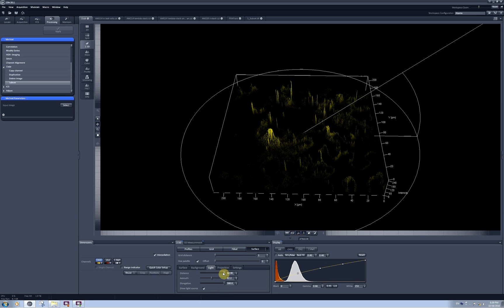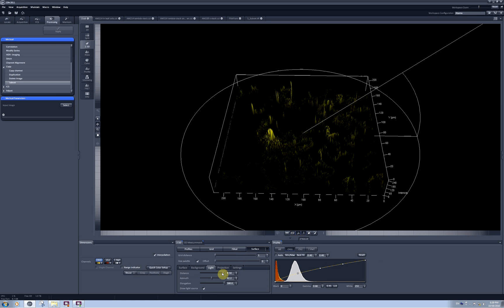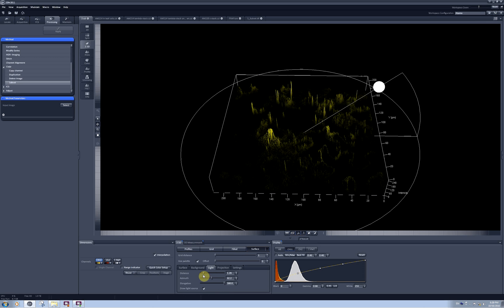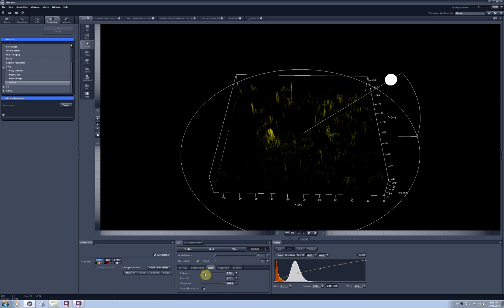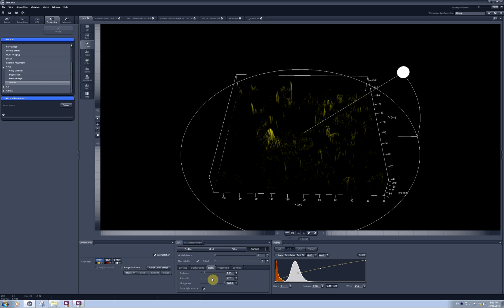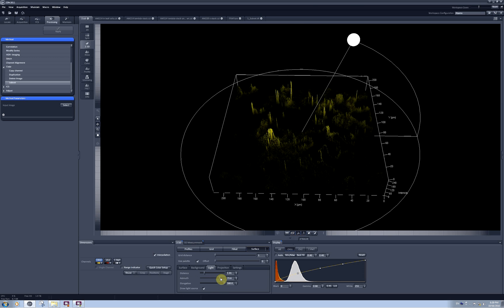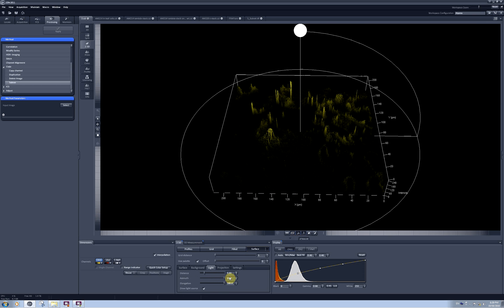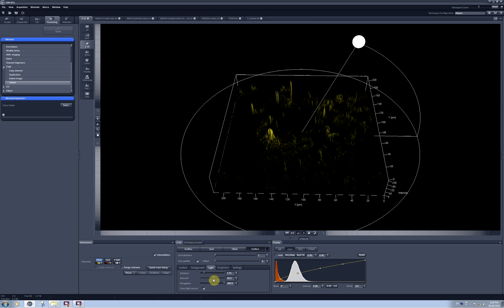I can ask the software to bring the light source closer to my model. So now I can see the light source. I can change its tilt angle, the azimuth. And it will change the size and the shape of shades my model is creating.